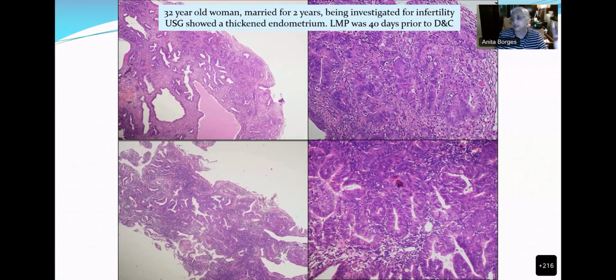Yes. You know what I mean by system, Ruta? Yes, ma'am. Means unopposed estrogen in the body in general. Yeah, so the system is the body, right? So do you think there's estrogen in this system, or has been in the system? Yes or no? Yes, ma'am, because I can see mitosis. You can see mitosis. Excellent. So there is estrogen in the system.